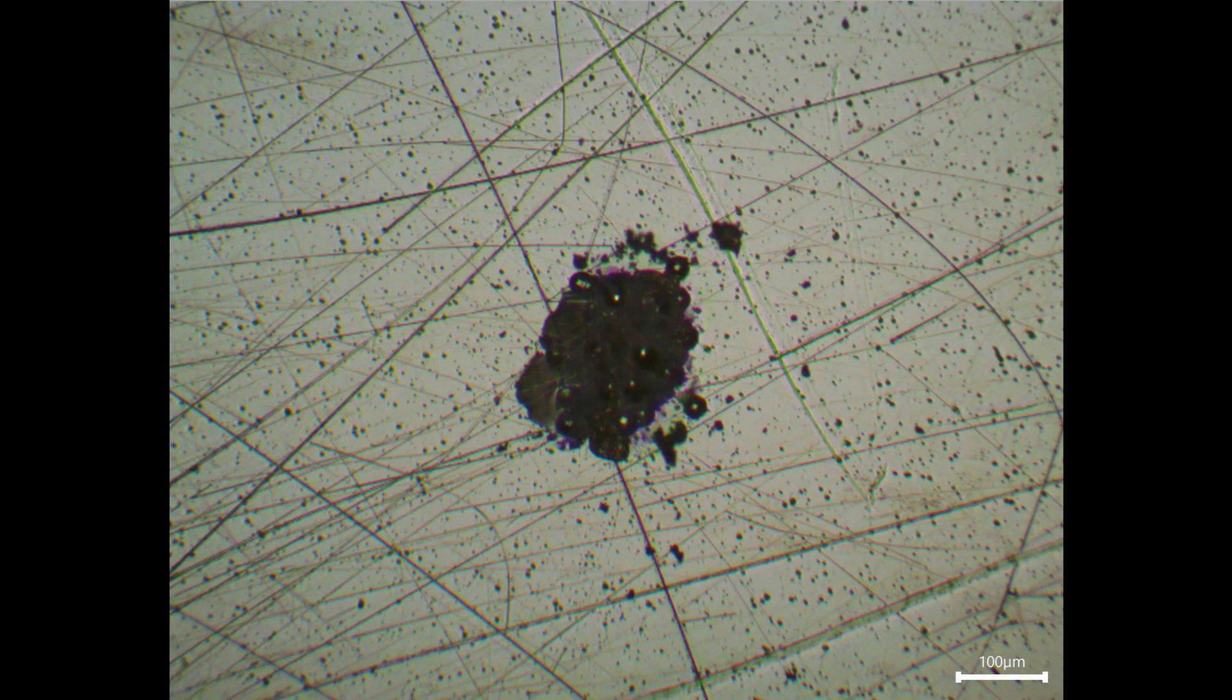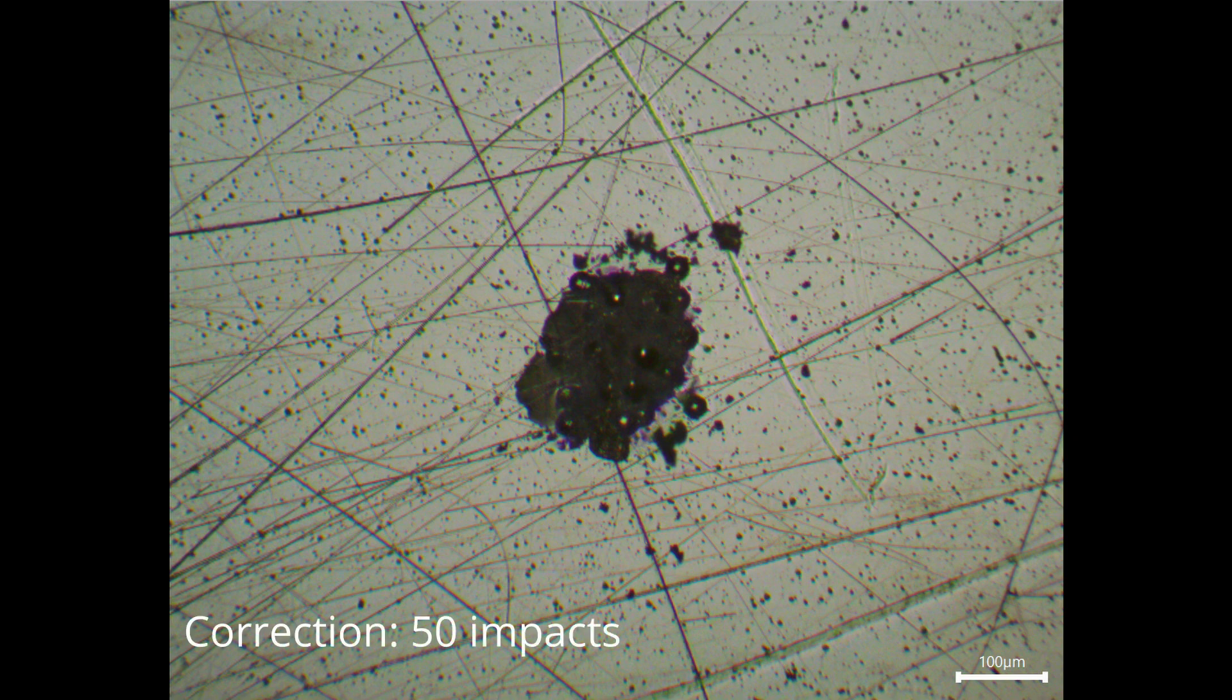So now the best way to analyze your randomized impact is by microscopy. So, we have here our micrograph of the impact area. As you can see, there is extensive damage. This was caused by 50 impacts on a 125 by 125 micron area.